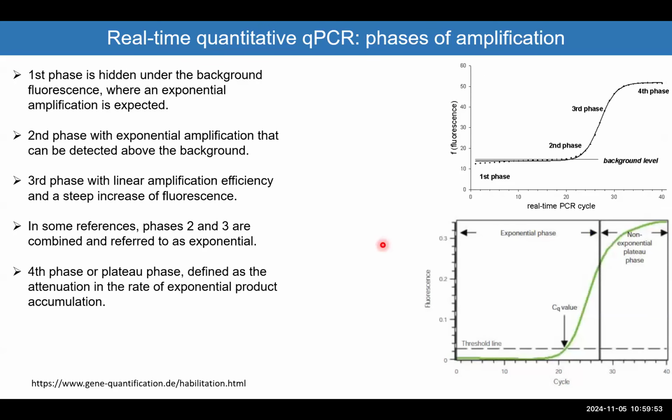So then, how do we read the results of a qPCR? If you set up a reaction, you put all the components, including the dNTPs, polymerase, and the primers, whether you are using SYBR or TaqMan with the primers, and you start doing the cycling, which is denaturing, annealing, and amplification again and again and again.